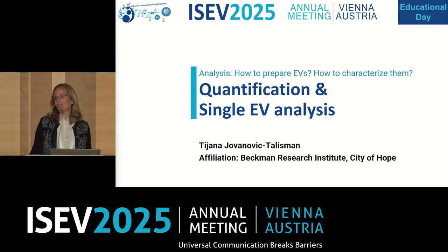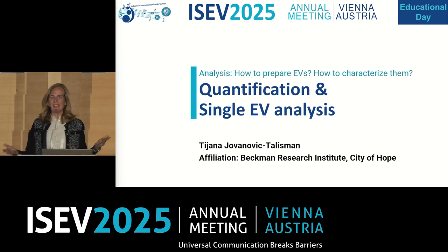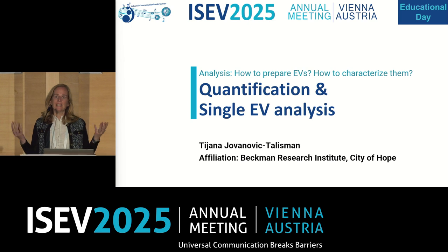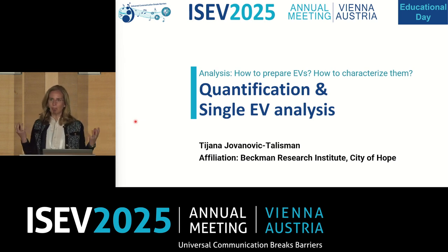It's really a pleasure to be here. And I think that today we heard a common theme, and that is that extracellular vesicles and particles are quite heterogeneous. There is challenge in this heterogeneity, but there is also a wealth of information. But to get there, we really need to use multiple techniques often, good standards, good protocols, and report things properly. And MISEV guidelines certainly help with that.